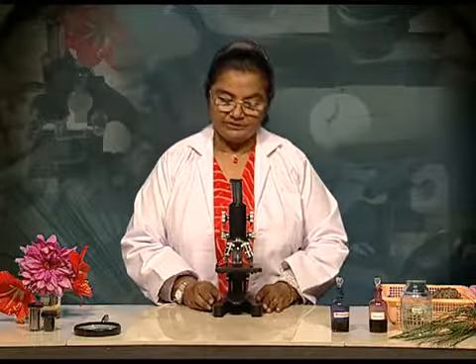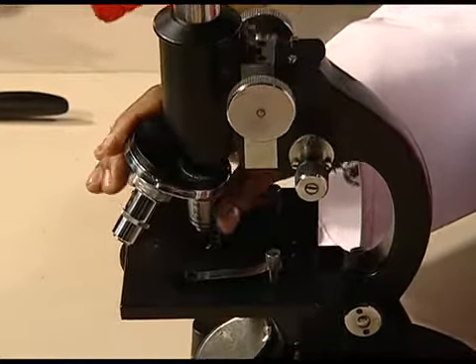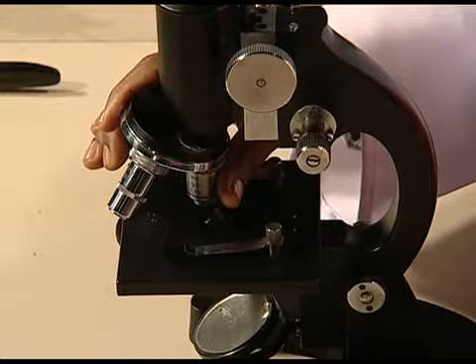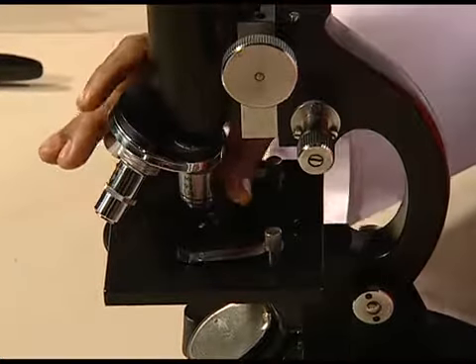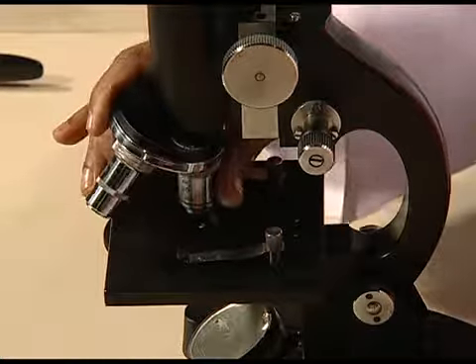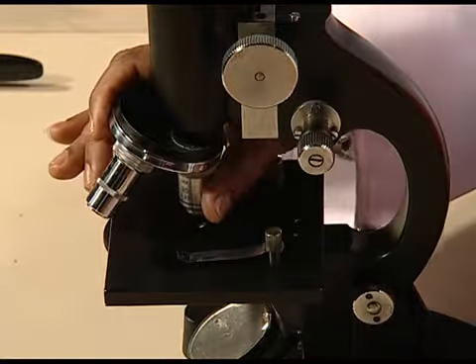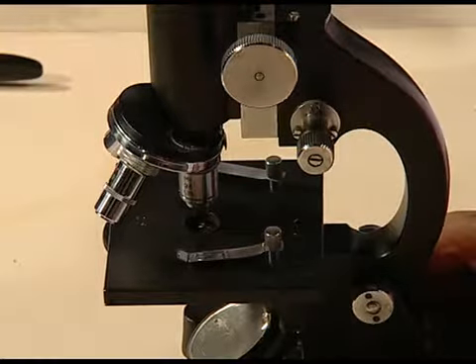First and foremost, lock the low power lens in place. If you remember, 10x is the low power lens. When we rotate the disc, we should be able to hear a click sound while locking the lens in place.